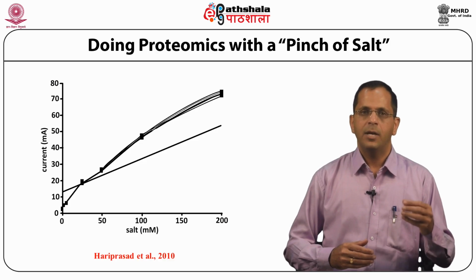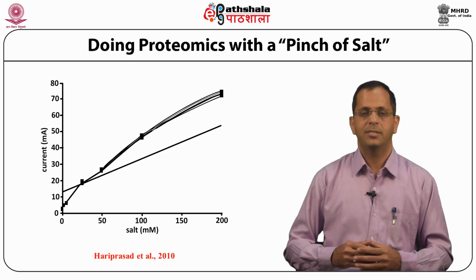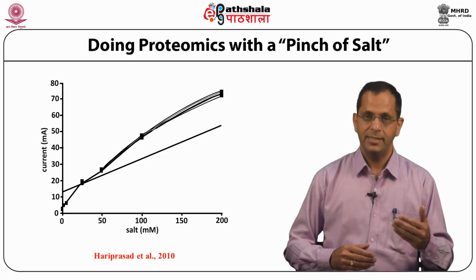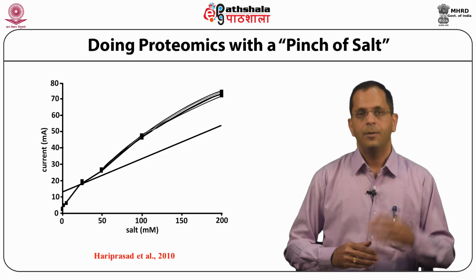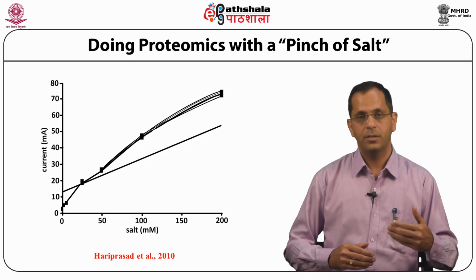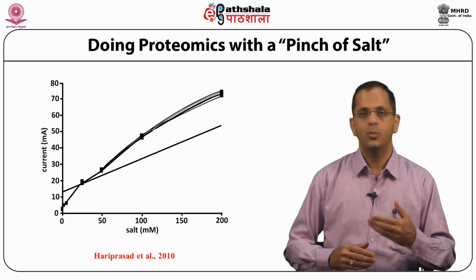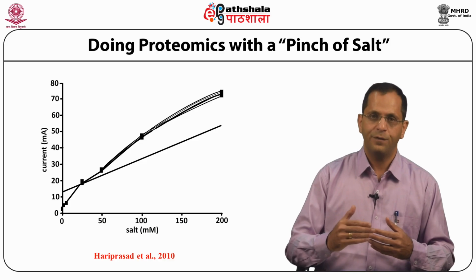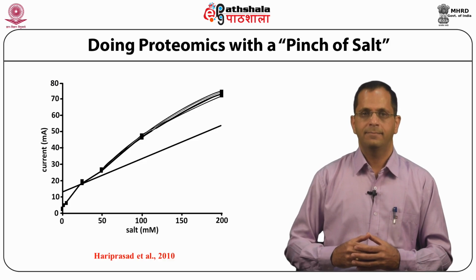You could be having precipitation of proteins that causes streaking in the gels. There could be an increased conductivity of current that results in heating and burning of IPG strips. You could have movement of water because of osmosis, which results in drying and swelling of the strips. There could also be a creation of a salt front which terminates isoelectric focusing.